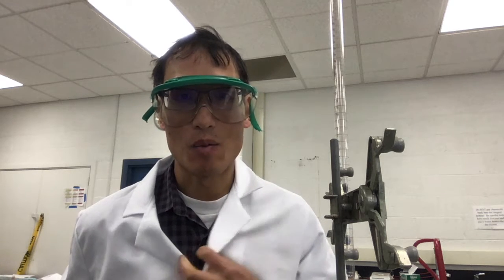Hey everyone, we are going to do a titration today. And I know that in chemistry, this is one of the things that most of my students look forward to doing. So it's kind of sad that we don't get to do this in real life, but maybe I will try to set up something for you to take home to try to use indicators and see what's going on. There'll also be an opportunity to do this virtually. But in the meantime, I'm going to show you what titration actually is.